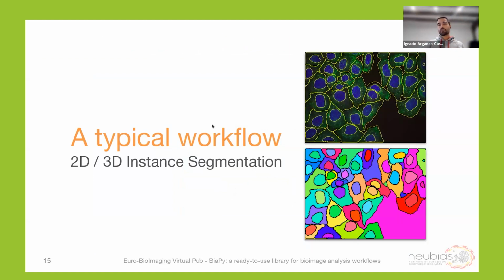So that was the first part of the talk. About the second one, because as I said, this is something that I guess we all face when we work with microscopy images, I thought it could be interesting to go into more detail for a typical workflow, such as the 2D or 3D instance segmentation.